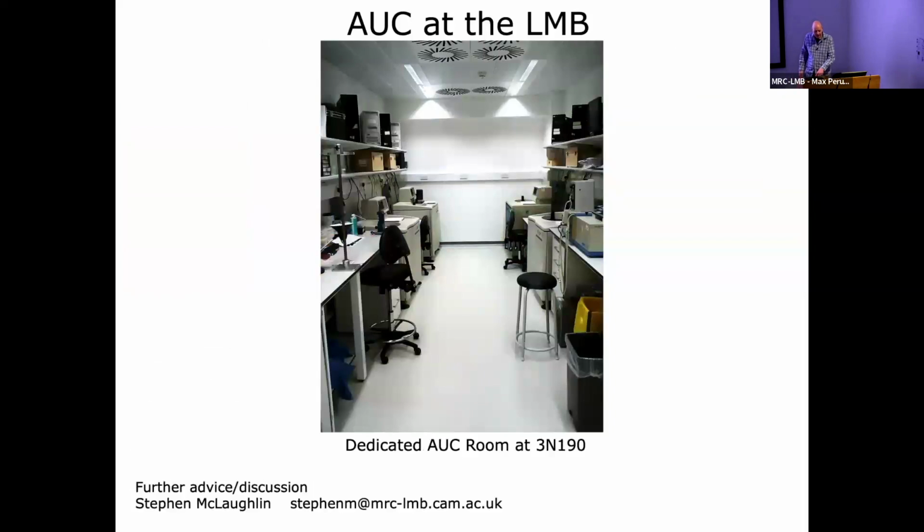We're very lucky here at the LMB that we've got a dedicated AUC room, and we've got different detection systems and different centrifuges. So come and chat if you want any advice, or if you want to think about running any AUC. Thanks for coming.